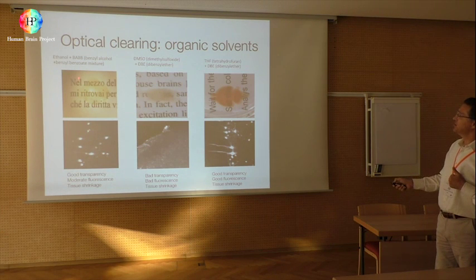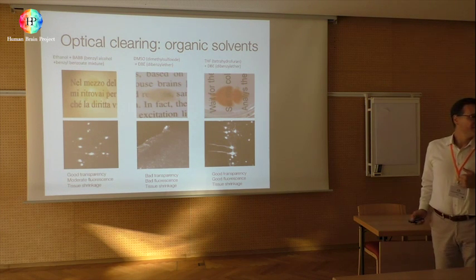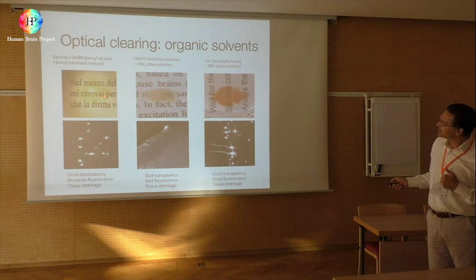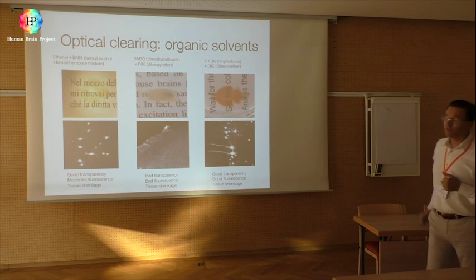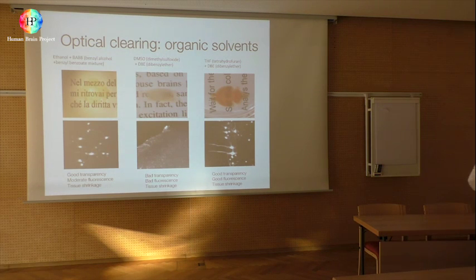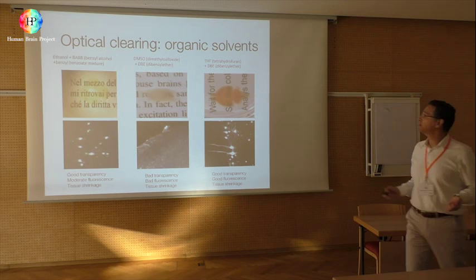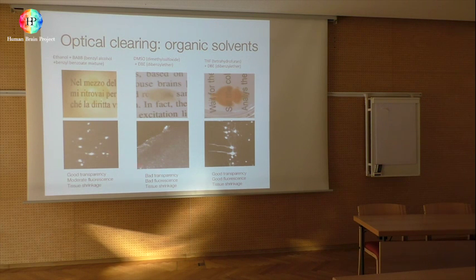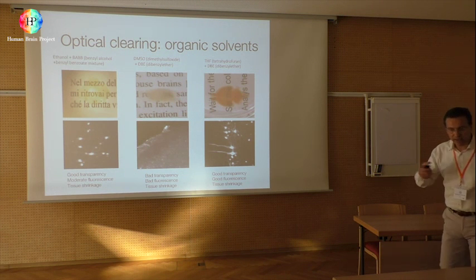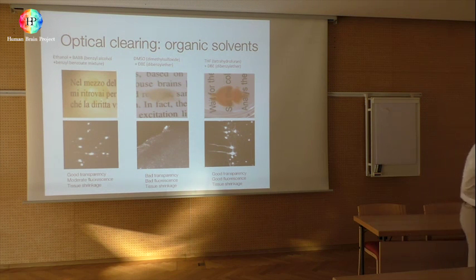And there we go. You don't see it here, but there is a brain. It's transparent. You can see slightly the shadow, like here. This shadow is just the autofluorescence of the neurons, which are GFP labeled because it is a transgenic mouse. But you make the brain transparent. And there are different ways to remove water, with organic clearing, organic solvents, but each one of those has some advantages and disadvantages.